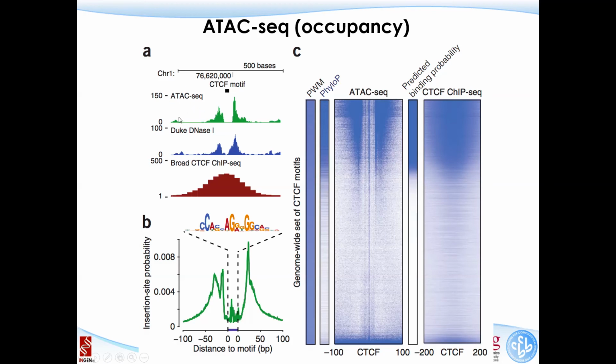This is ATAC-seq, this is using DNase, and this is ChIP-seq. You can see using ChIP-seq targeted on the CTCF protein, you are observing a big peak here. That means CTCF is binding there, and that part of the chromatin has to be open. So in this region, there are a lot of signals being identified, right?